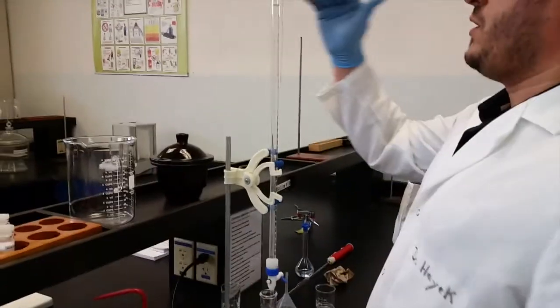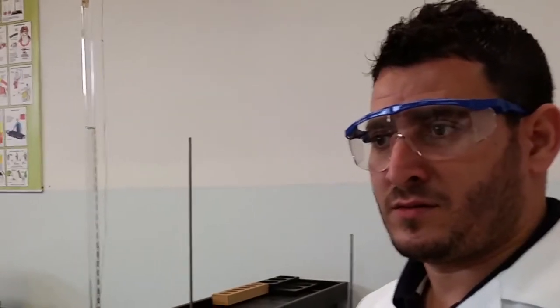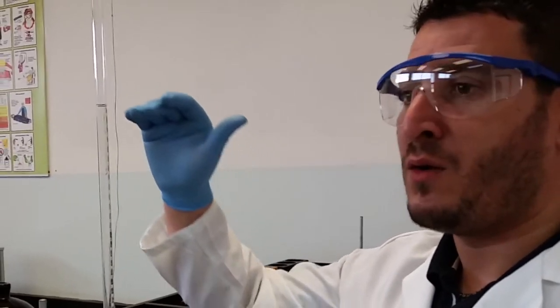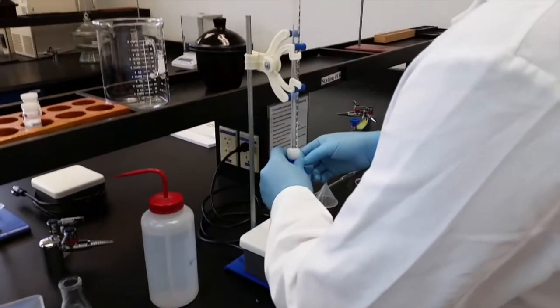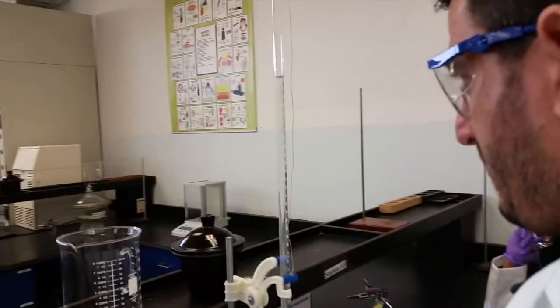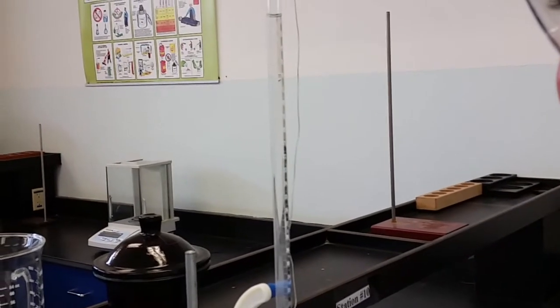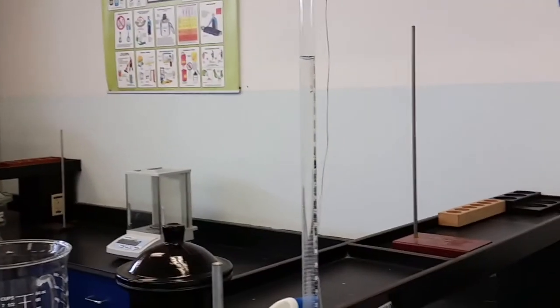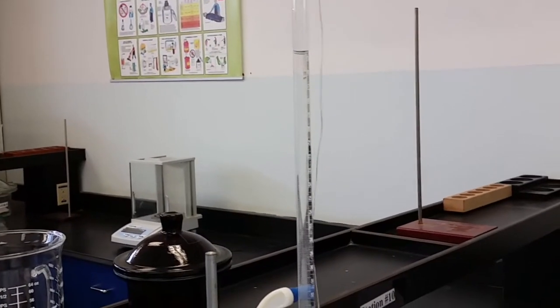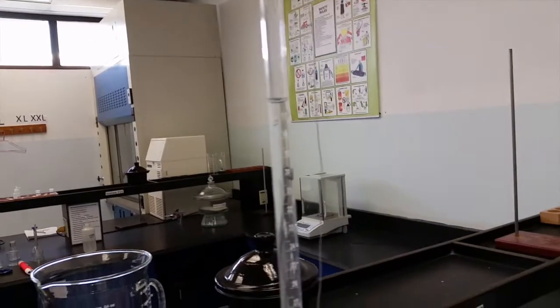Okay. So now it took 9 milliliter to neutralize the acid salt. I don't need to go one by one now. I will add 7 and then go dropwise. So from 9 to 16, I will add quickly, and I will stop the addition at 16, which means I added 7. Okay? So here I'll stop at 16. See, the color did not change yet.